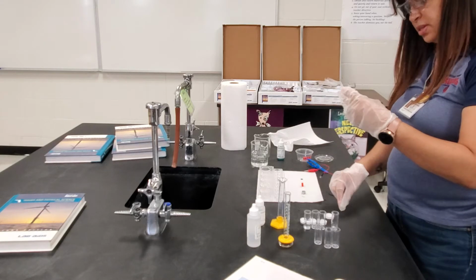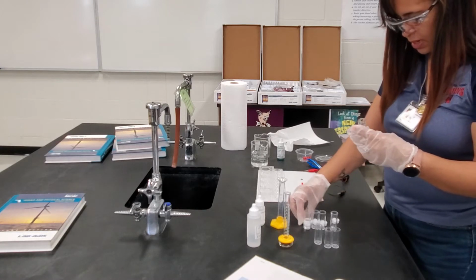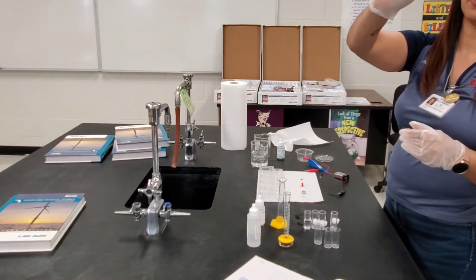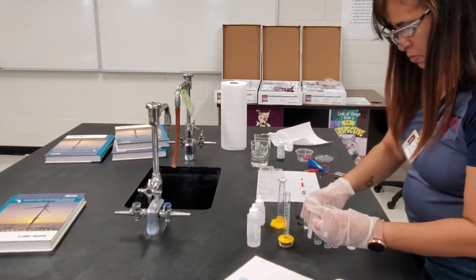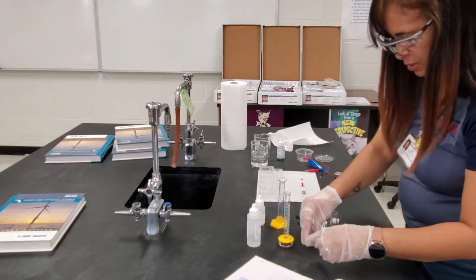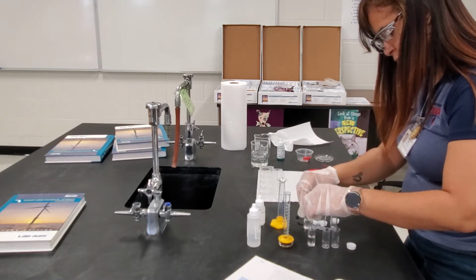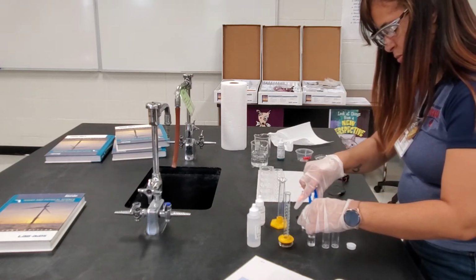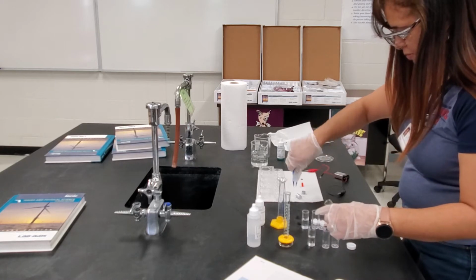So this particular substance sinks in ethanol as well. So it sinks in water and it sinks in ethanol. So again, pour the ethanol into a second vial so that we can reuse it, and grab our sample and place it to the side.